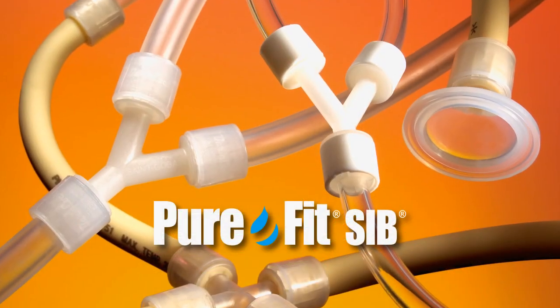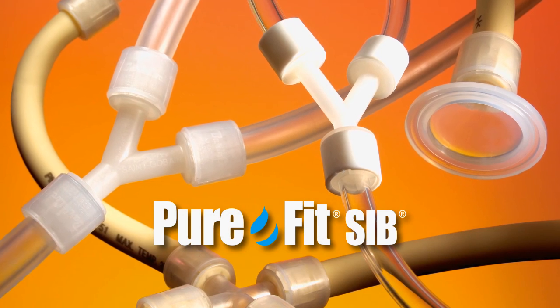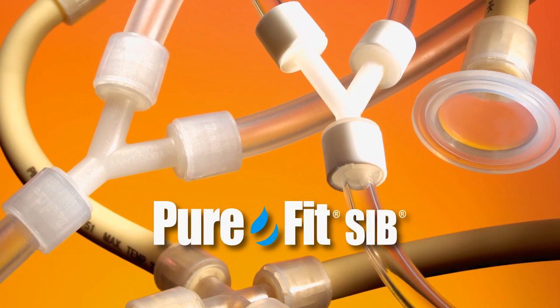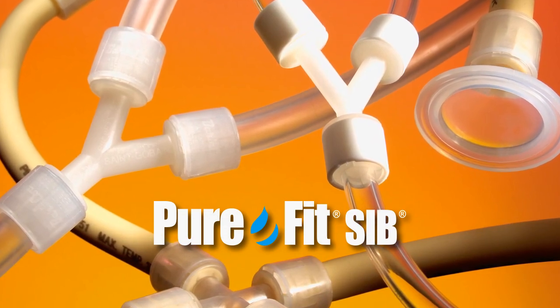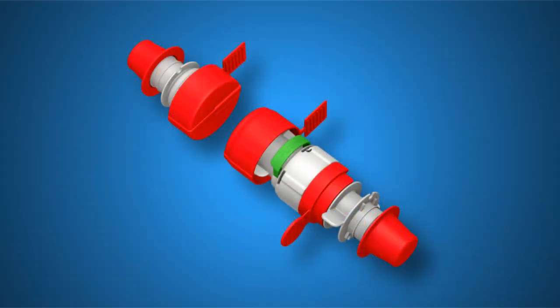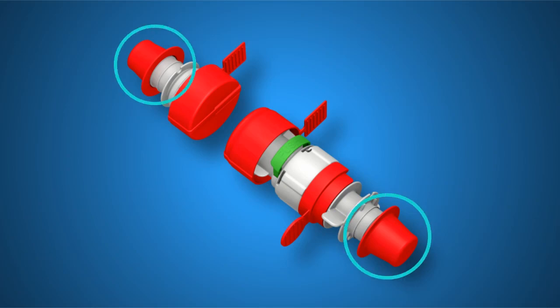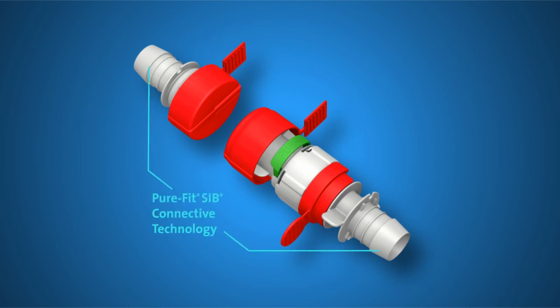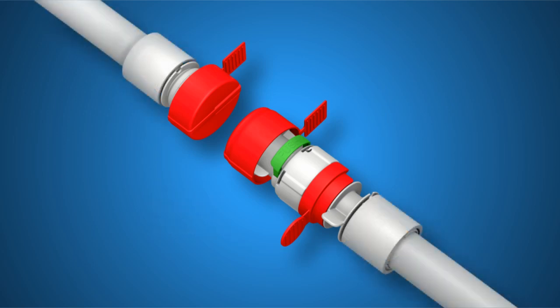Before assembling PureFit SC, you must first assemble PureFit SIB. PureFit SIB consists of a barbed end used to connect the sterile connector to tubing for your critical fluid handling. Remove the inner and outer housing safety caps, then attach the PureFit SC sterile connector to your desired flexible tubing, such as C-Flex TPE or Sanitec silicone tubing, using the PureFit SIB barbed ends and retainers. The PureFit SC design allows fluid path to flow in either direction.